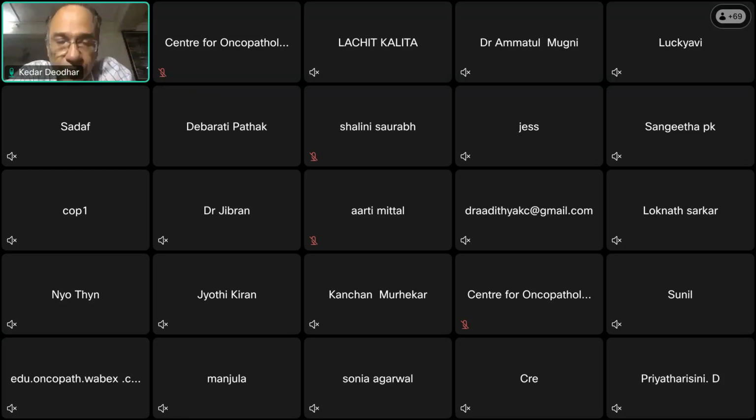Okay. Is there any cutoff of site-specific lymph node yield in GI cancers post NACT? For colorectum, a minimum of 12 are required. For gallbladder, 6 are required. And for stomach, at least 15 to 16 are required. We understand that post-chemotherapy, the number is going to be low. But our attempt will be to regross and get as close to the prescribed number as possible. And we should mention in our report that regrossing is done and extra sections do not yield any additional nodes, or yield 2 small additional reactive nodes, something like that.